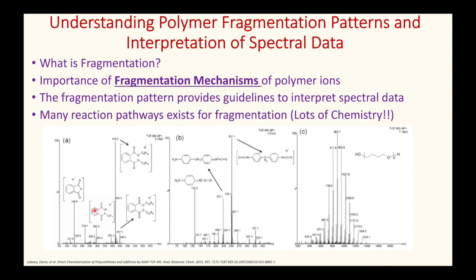There are mechanisms that we can apply to really understand the process. And again, we could do the same thing with this spectrum, and we then notice something else is happening. We see that there are rearrangements of the double bonds. So that's something else to keep in mind when evaluating the fragmentation patterns. This is a monomer, and the difference between this spectral line and this spectral line is really the molecular weight of the monomer unit for that polymer.